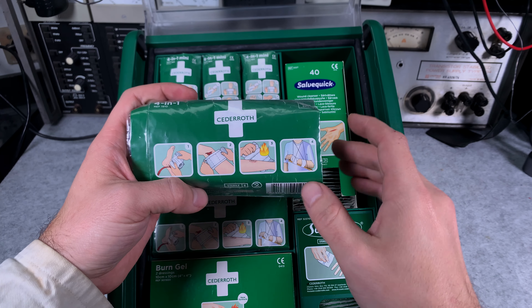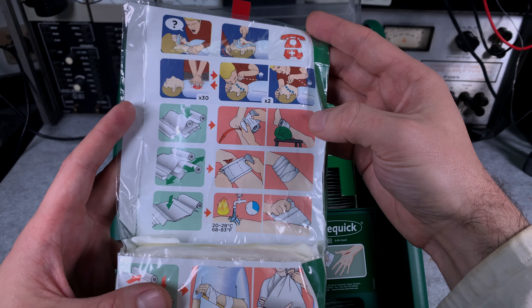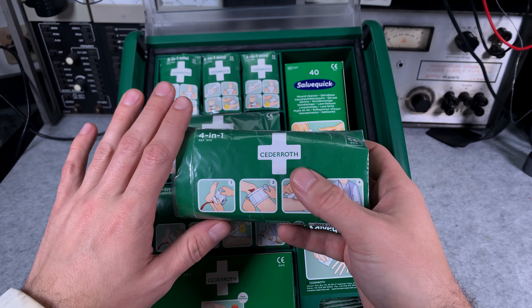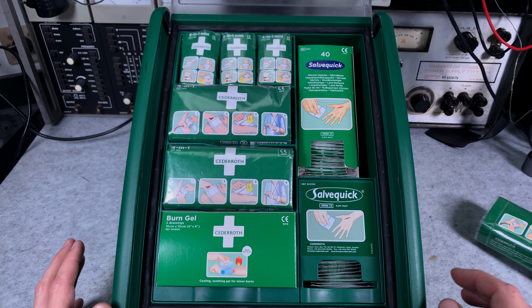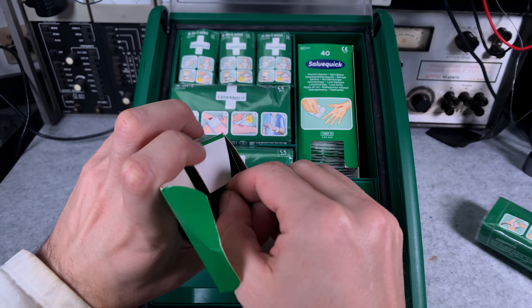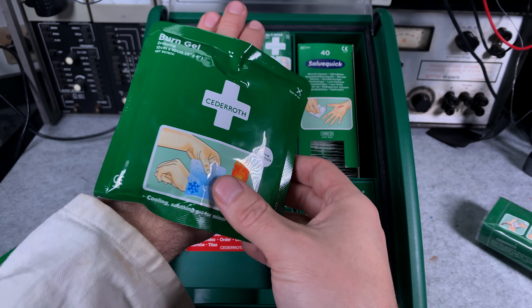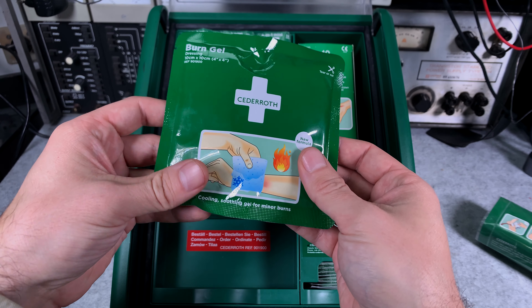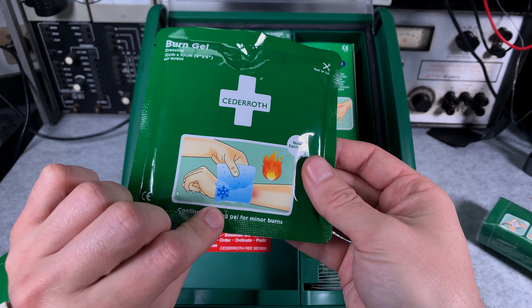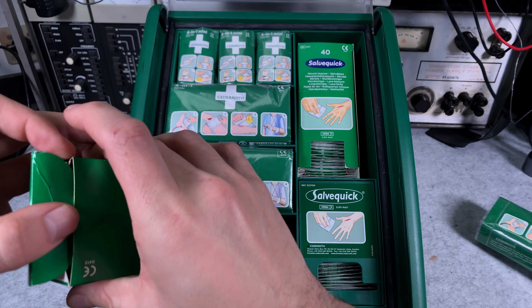I recommend checking the online video because the manufacturer shows you how to apply them and they are pretty universal. If you open one like this you get not only the instruction but a full-fledged dressing inside — it is extremely nice and I highly recommend checking the manufacturer. On the bottom we've got a burn kit: burn gel and towels filled with gel that you apply to your burn. It gives you a nice sensation of cold — it's not an ice pack, it won't magically cool down, but it gives you that feeling. For electronics lovers, if you ever burn yourself with a soldering iron, this is the way to go.